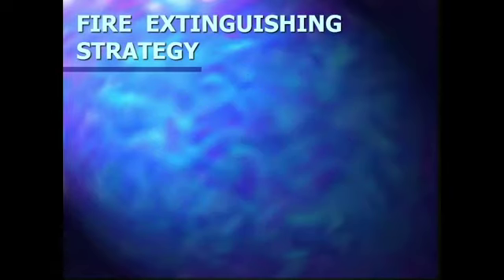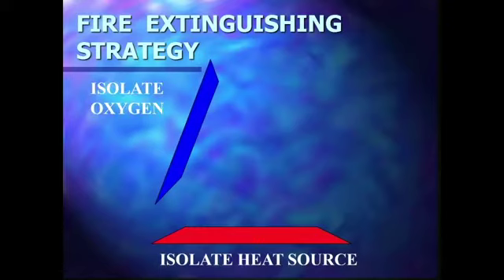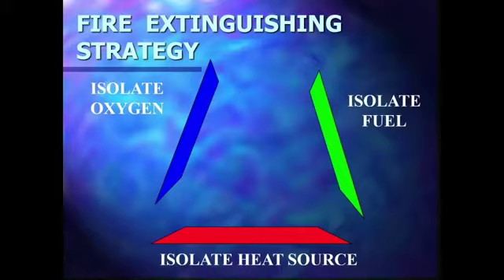In order for us to understand the fire extinguishing strategy, we need to basically understand to isolate the heat from the source. The second strategy will be isolate the oxygen, and the third strategy is isolate the fuel.